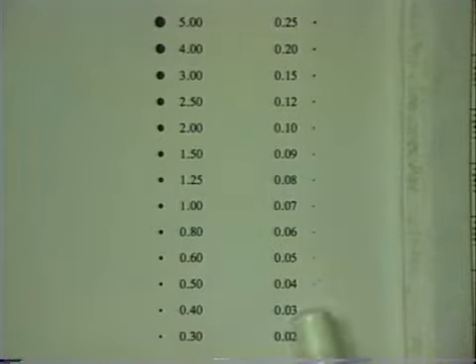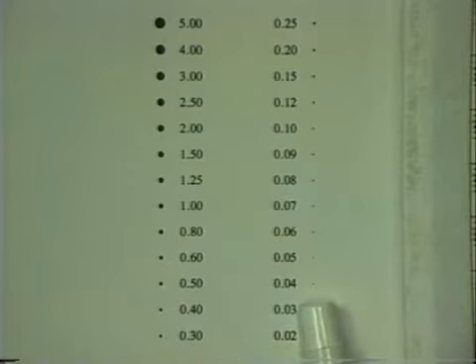And actually, that is the threshold, or the border, between what Tappi historically wanted us to count as dirt. So anything above 0.04, the operator was instructed to count that as an area and count that as dirt.